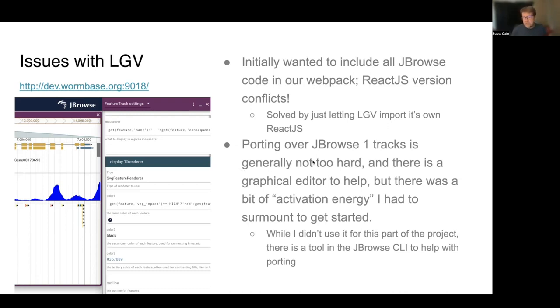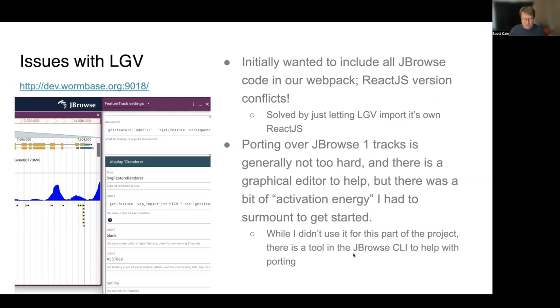Porting over the tracks from JBrowse1 is not too hard. There's a graphical editor that lets you enter stuff in, and it's dynamic so that when you enter things in it happens automatically. There was a little activation energy to get started, but once I got rolling it was very easy. There is also a tool in the JBrowse command line interface to help with porting — you can feed it a config and it'll spit out something. We've got lots of bigwig and bigbed tracks that I'll probably use that tool for so I don't have to touch them manually.